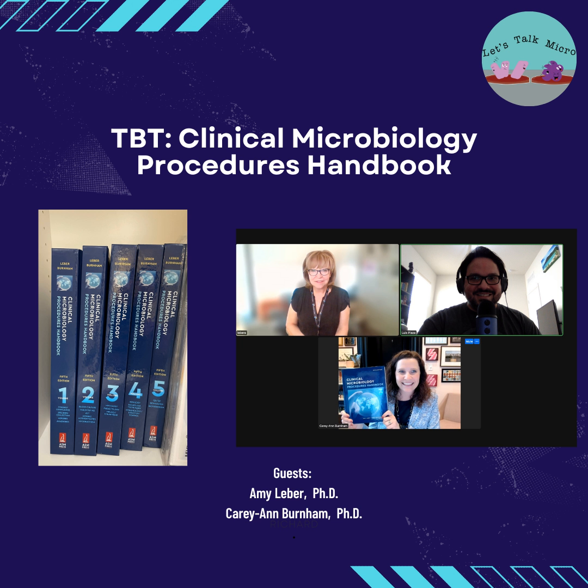Amy, anything you'd like to add to that? No, but I just think it's so true that a lot of this has a lot of historical background that's not in the literature, but we want to have at least one place where it's written down so that we can have some kind of reference for these procedures so they're all done the same. That's really key, is that if we all perform things similarly, we can get similar results no matter what lab we're in. I think that's a great point.